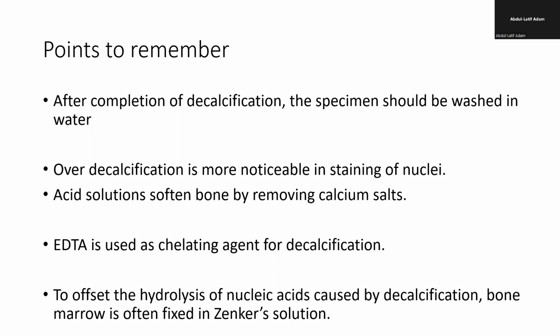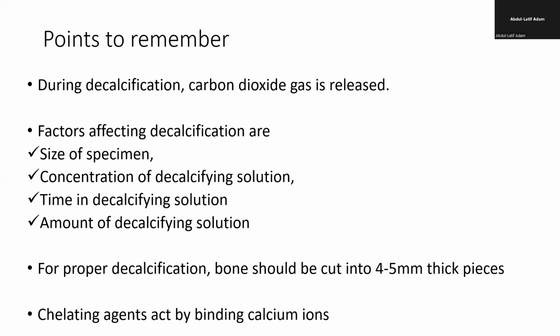It will not give clear staining. So it is important that you remove the decalcifier from the tissue. It's not good to leave it in, because it affects subsequent staining.